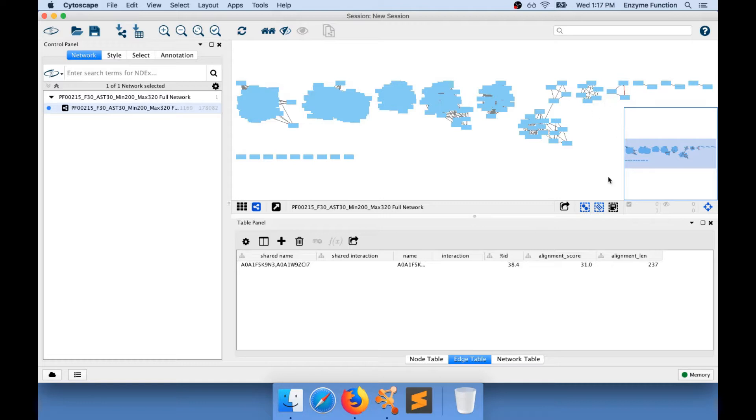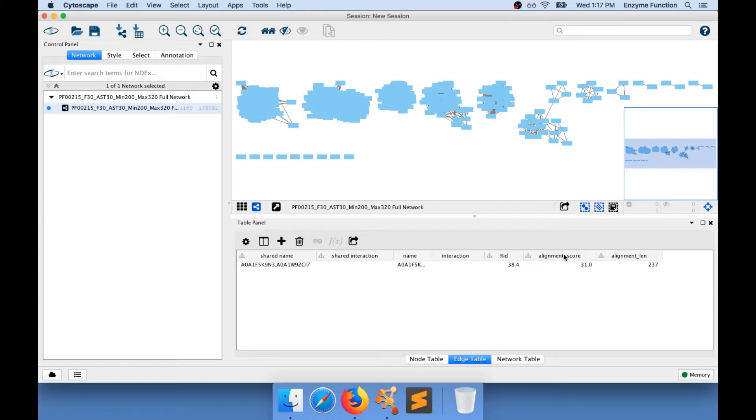I know that the alignment score between these two nodes is 31, and the alignment length 237. The alignment score is the value on which you apply a threshold when you establish your alignment score threshold on the EFI website.